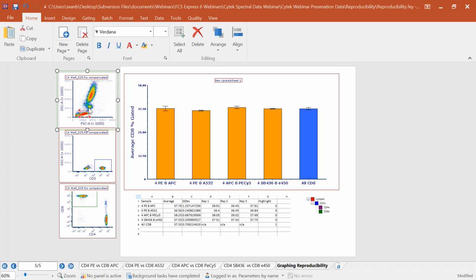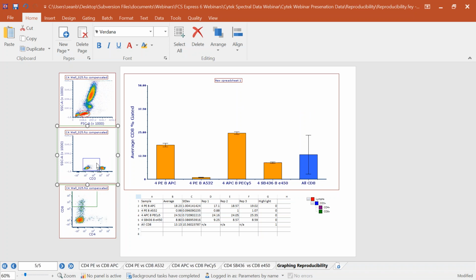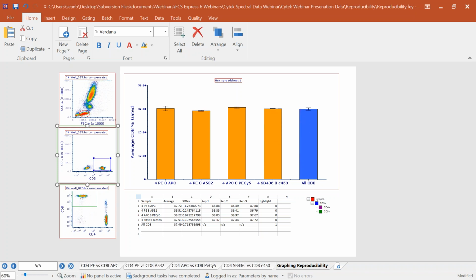And it doesn't just apply for doing things like this. Really, any sort of analysis you can do, you can use these live updating gates. And if we wanted to examine what happens when we move between the different populations, we get that final result in real time directly in FCS Express, and we can link it all back to the FCS file data very simply and easily. So once we've put all of this together, we've decided what our controls are going to be, beads versus cells. We've decided what type of dyes to use in combination, which types of dyes to use on which of our markers. We can put it all together and start an actual analysis for our data.